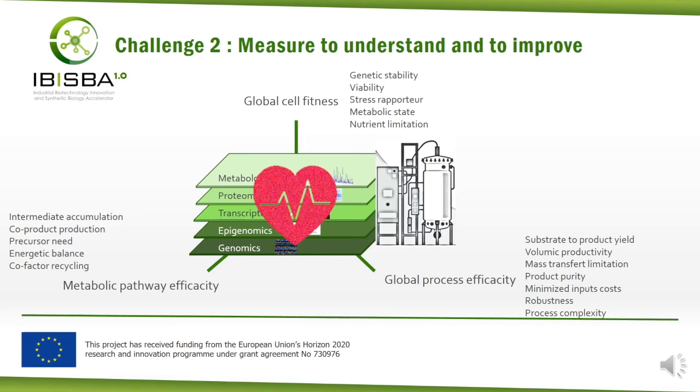Data must be collected in order to quantify these 3 indicators. This is possible by testing the strain process under different modalities and by monitoring key variables.